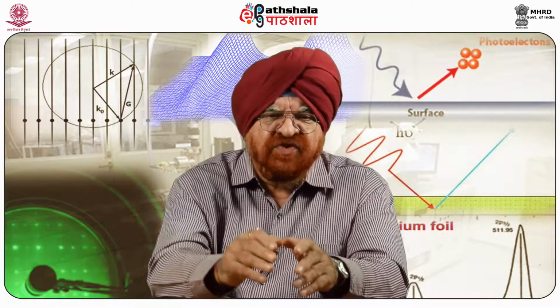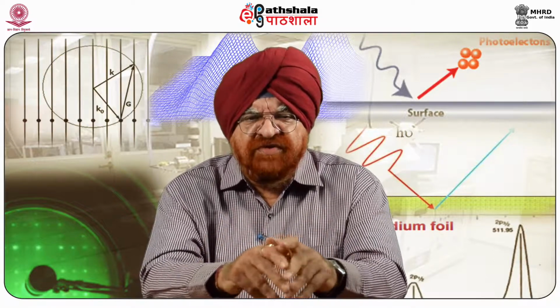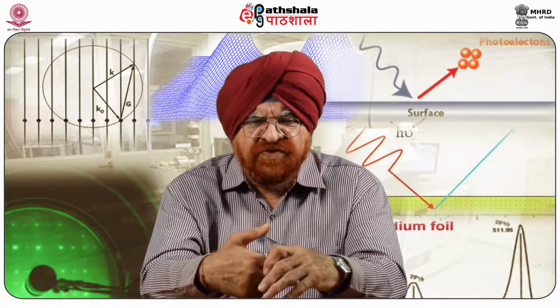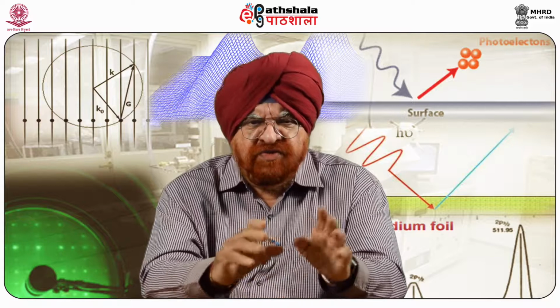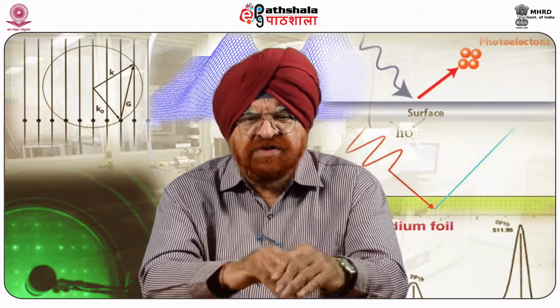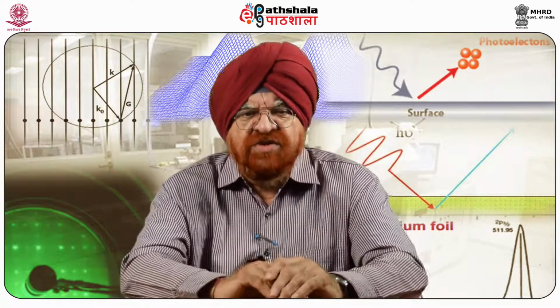So, students, after having studied magnetic force microscopy and the way images are formed, we have dealt with data analysis in this particular module. And you have seen the importance of this, as well as the preparation of surface data, which has been studied with the help of this. Magnetic force microscopy can be very properly summarized when we talk about this module, and I'm sure when you read the summary, you will be able to appreciate this much better.